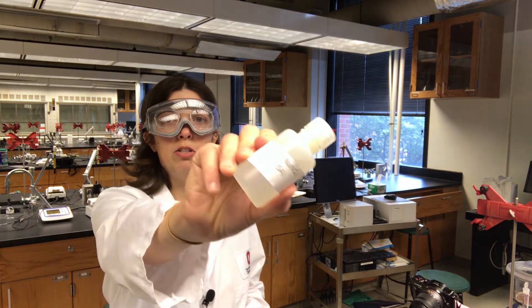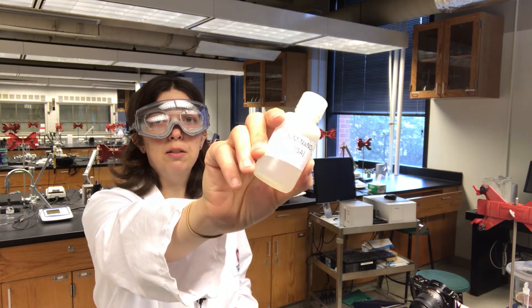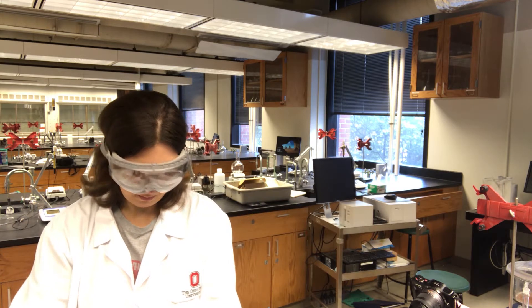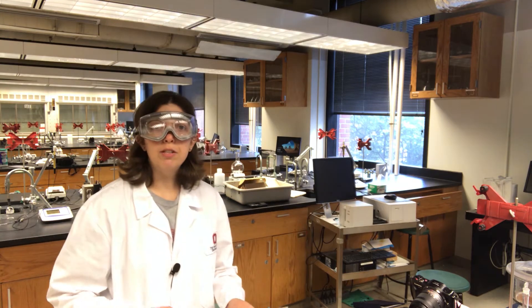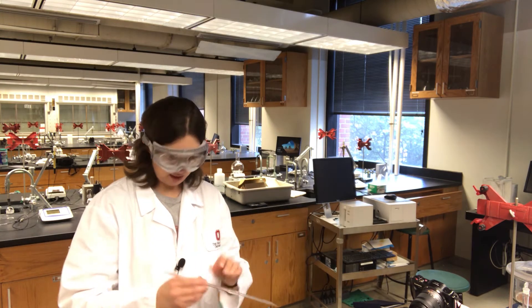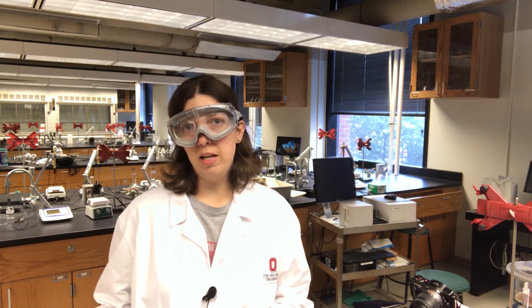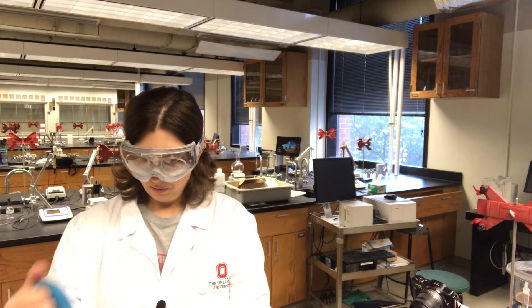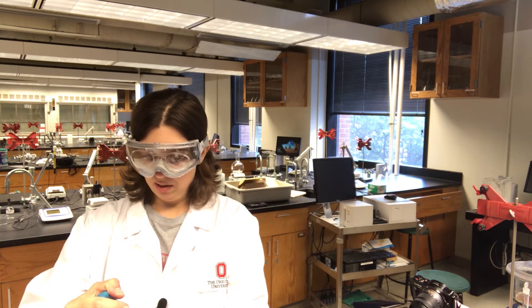Our ionic strength adjuster is 5 molar sodium nitrate. I'm going to add 2 milliliters of the sodium nitrate to the 100 milliliter flask. We want our solution to contain 2% of this 5 molar solution, by volume — so 2 mils out of 100 is 2%.